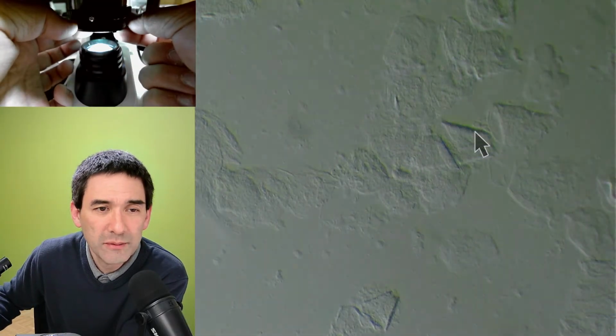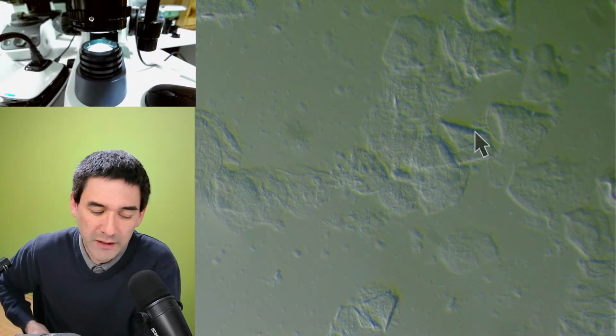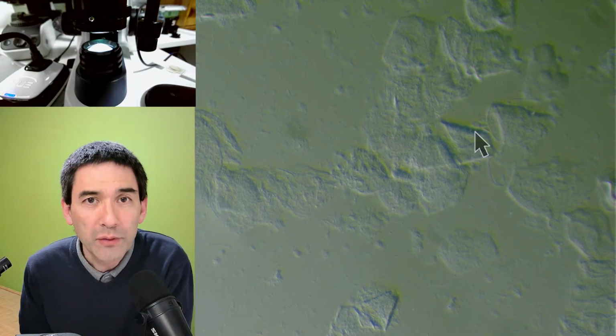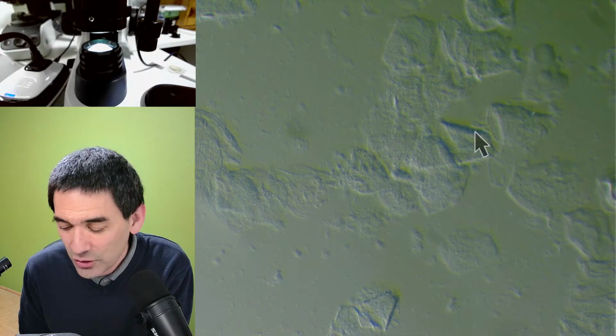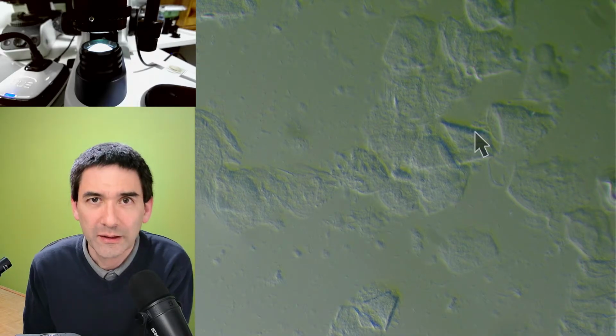So yeah, it's so fun. You can spend an afternoon playing around. So why I'm saying this: before you think about upgrading a microscope and changing around objectives, you can do that, of course, but why not play around a little bit with those filters here?